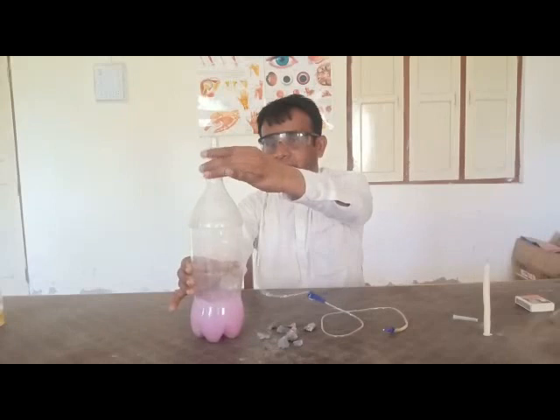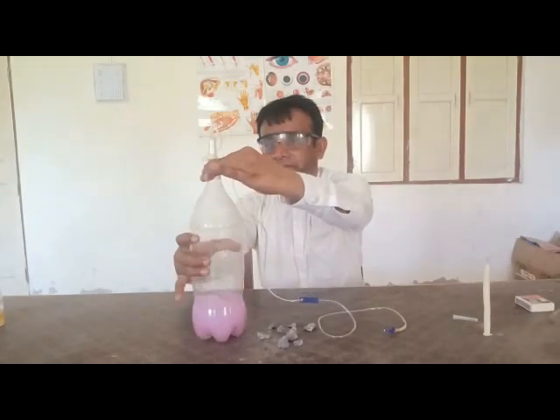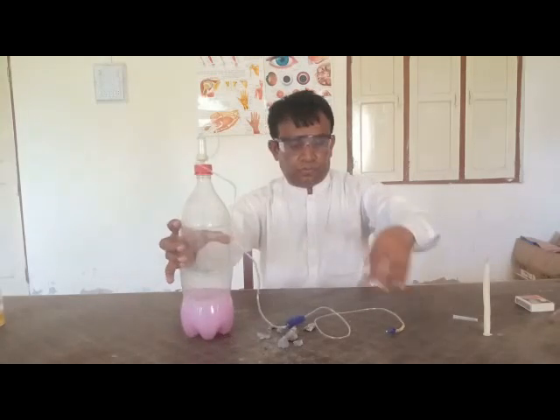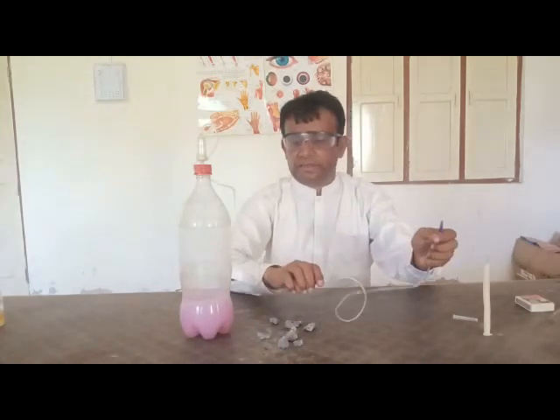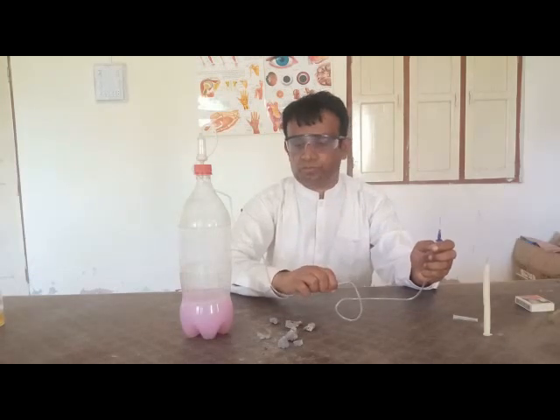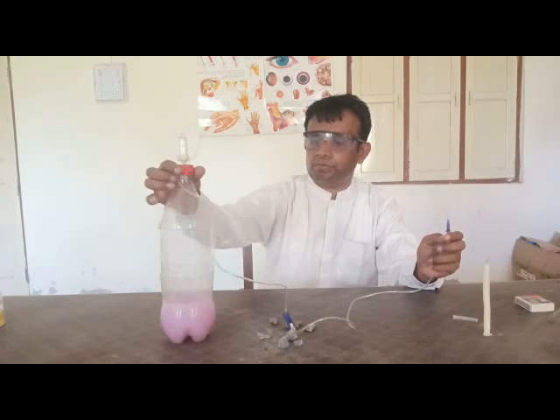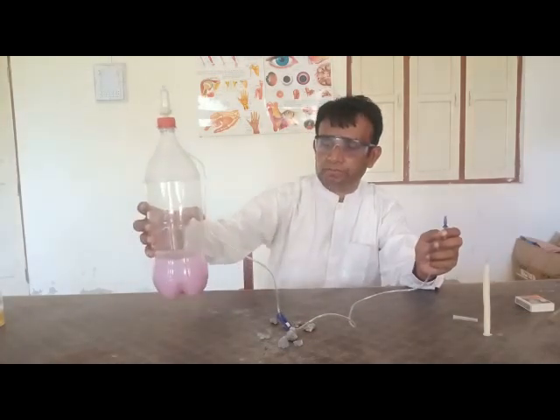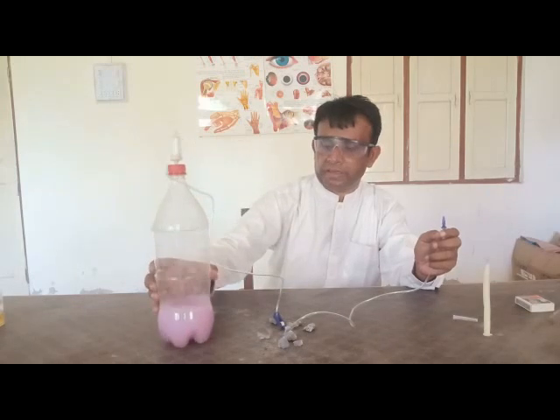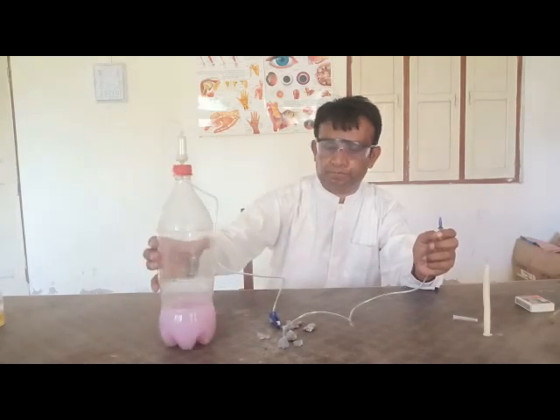Now look at this, the color changes. The color has changed. The chemical reaction is happening, and the color is changed. Ink color. And gas is going to be there.